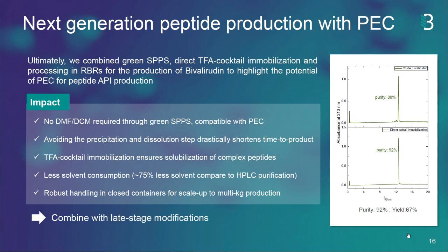I think I will go step by step. Yeah, please. These were all questions from the same person. I think the first question is what for the lysine, right? If the lysine protecting group is there, it will form imine. But as I told you earlier, when we use cysteine, this will cleave the lysine imine bond, and it forms the stable cyclized product. So lysine won't be a problem. So it's a reversible reaction. It will form imine, but when we use cysteine, it will be cleaved off.